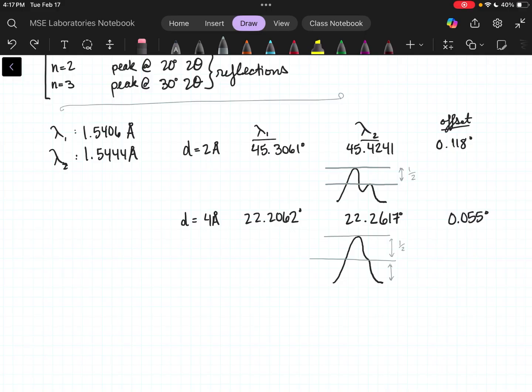Okay, let's talk about stuff that doesn't really work in XRD. So we talked about the purpose of XRD being long range predictable order, right? We are aiming for something that is crystalline. In this application, we're talking about something that's powdered, so it's going to be random orientation. It could also be a piece of metal that you quench, or you receive a part and you want to see what this is. You can throw that in an XRD, as long as you have generally randomized orientation. You don't want everything to be facing one direction.